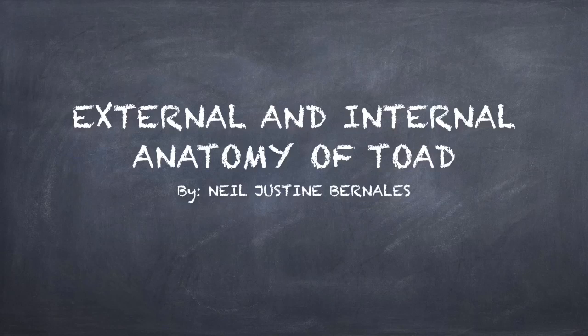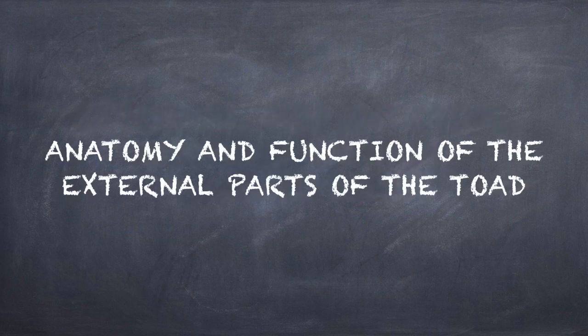So hi guys, this is the external and internal anatomy of toad presented to you by Neil Justin Bernales. Let us begin with an introduction.